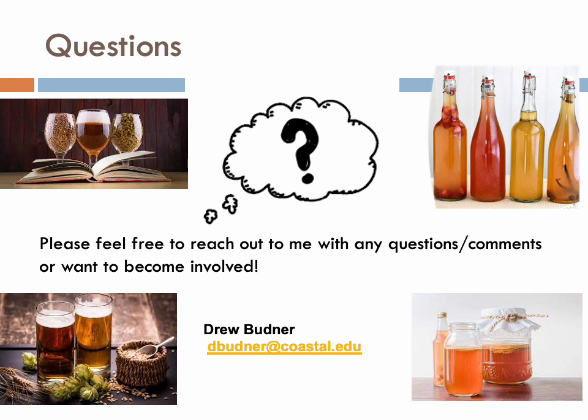One thing that I didn't talk about or even address is that I gave you concentrations for those compounds and their resulting aromas, but there's what's known as a flavor threshold, below which the human nose or palate won't be able to detect it. We haven't done any comparison between the concentrations that we're observing and that flavor threshold.